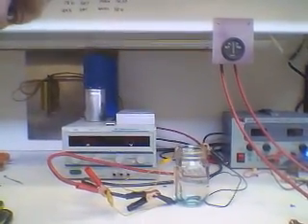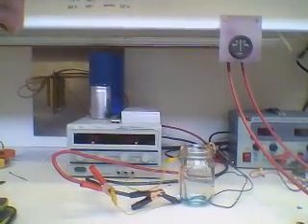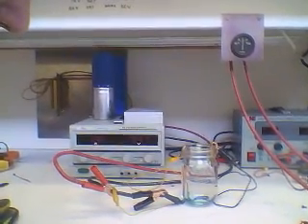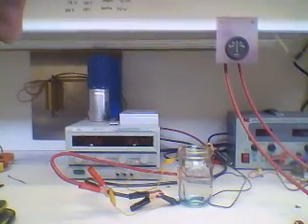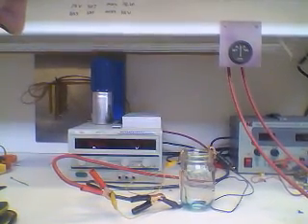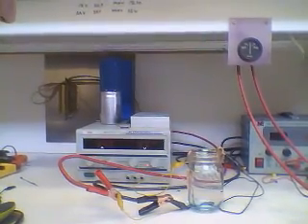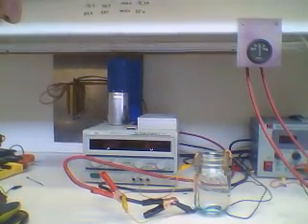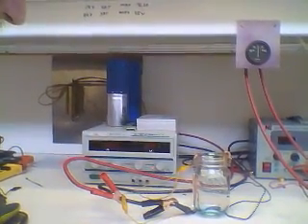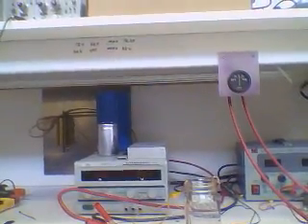Hi everybody, Chuck H here. In the background you'll see a little jar with a blue tint in the bottom. What that is, is a piece of quarter-inch pipe and a piece of solid quarter-inch copper in water with a little bit of sulfuric acid. We're making chemicals since they're kind of hard to get from China. You can see that meter — it's running about 5.7 volts, 0.6 amps. To make this you want to keep it right around an amp.